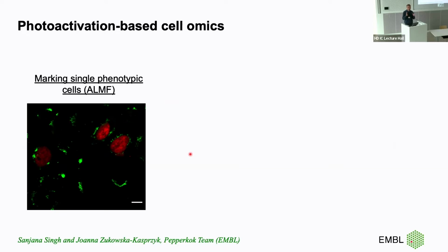So we were setting up the feedback microscopy experiment in such a way that we can image the sample, identify the right phenotypes, and define the photoactivation or photobleaching regions just to photoactivate the right cells. Why do we need to do it automatically? Because first, these are live cells, you want to do it as fast as possible.